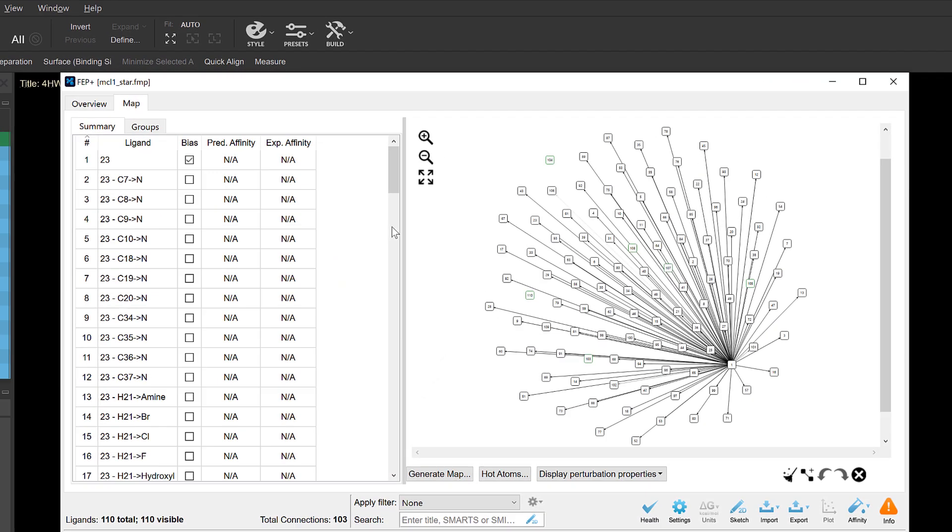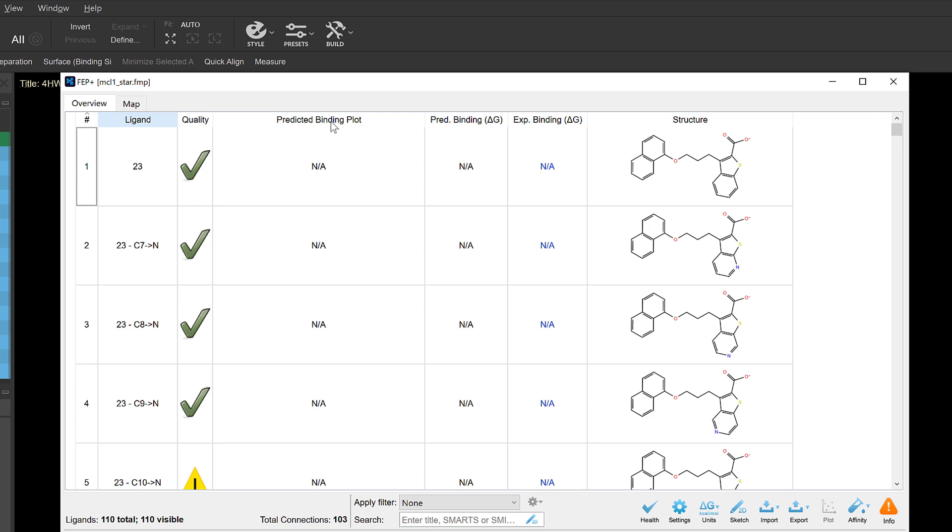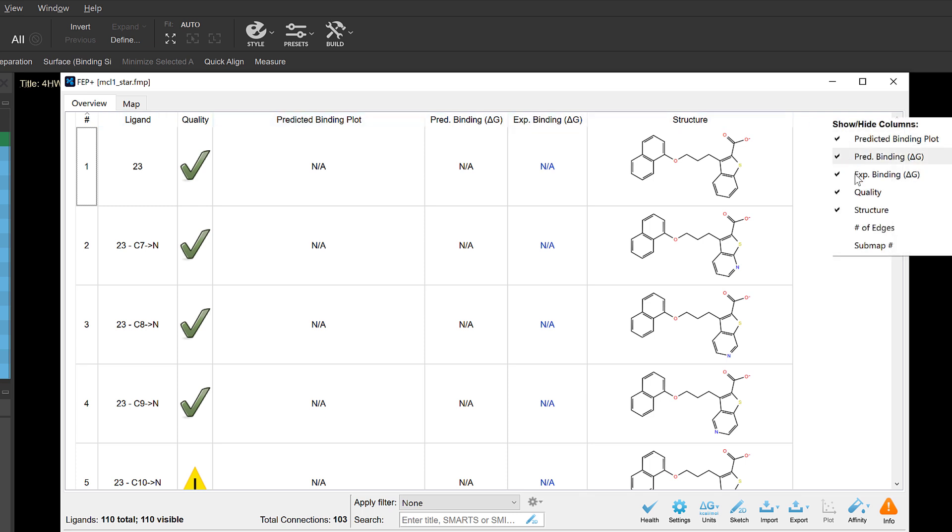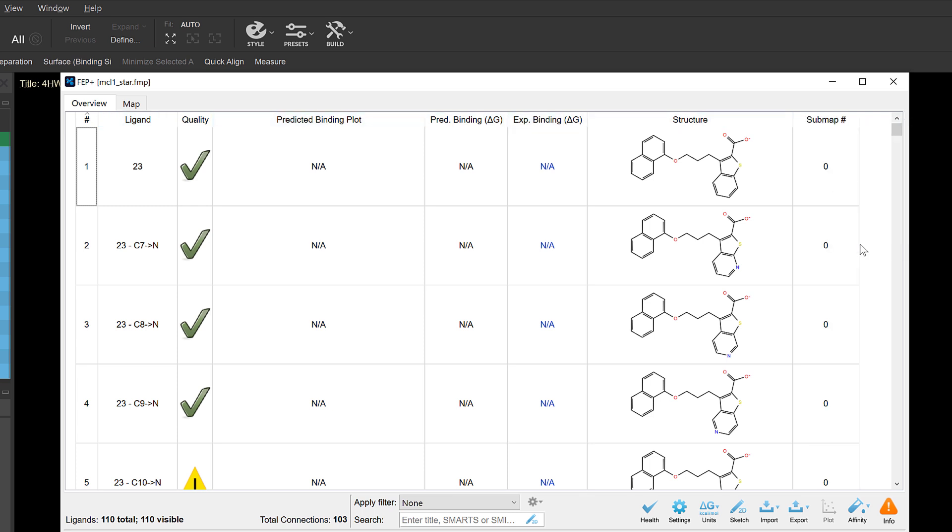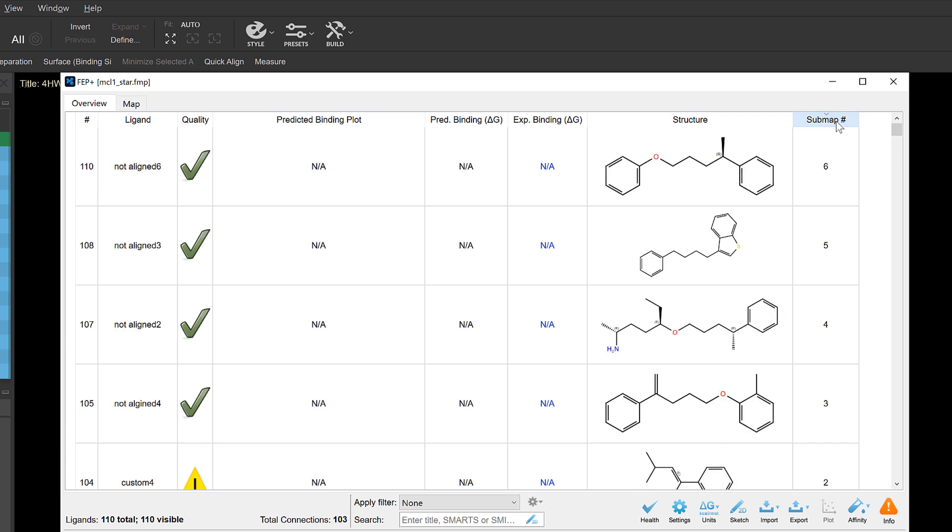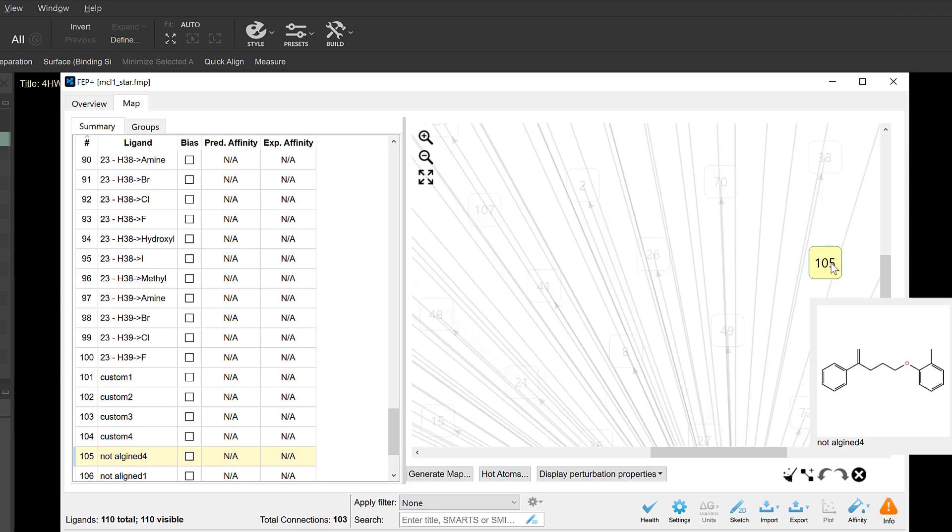And in Maps with a large number of compounds, one can now easily identify disconnected sub-maps, simply by right-clicking on the table header to enable the sub-map number column. Then sorted, one can clearly see and select the number of nodes disconnected from the main map.